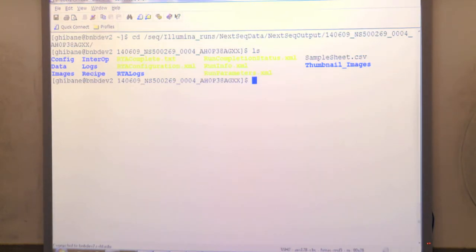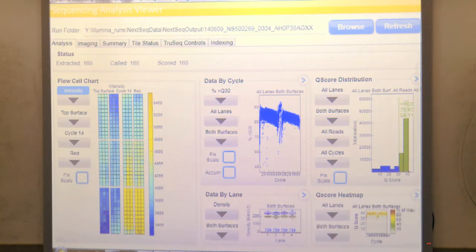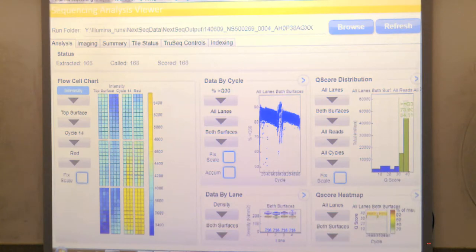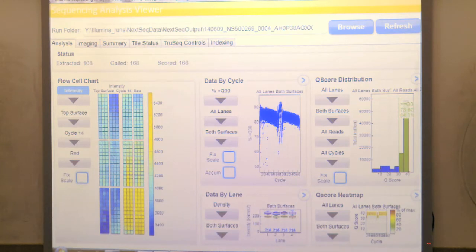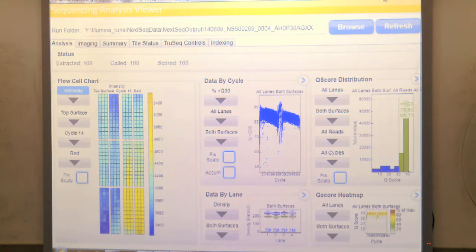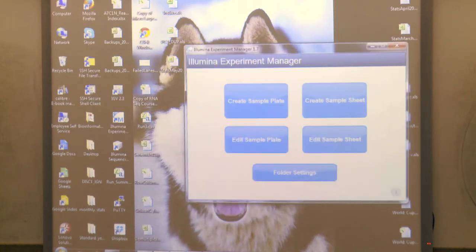My run looks good, so now I'll generate the FASTQ files. This run was four lanes of a pool of 16 libraries. Each library had barcodes allowing me to pull out the FASTQ file for each individual library. To do that, I need to generate a sample sheet that the software can use for demultiplexing. There is another piece of software called Illumina Experiment Manager, which also runs on PC only, that allows me to create these sample sheets.